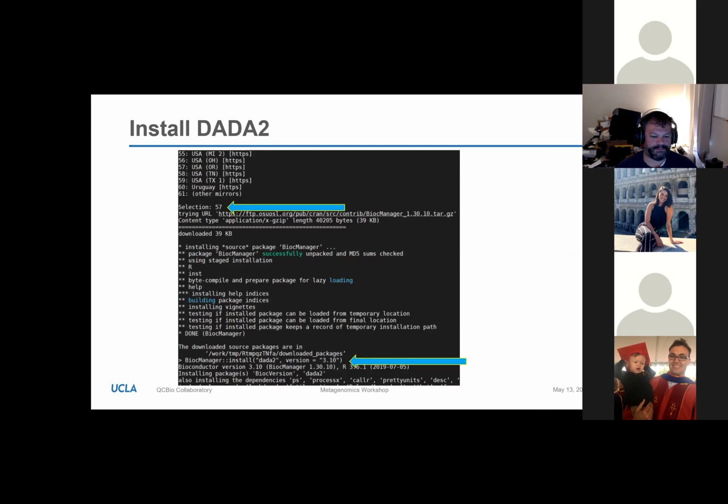Basically, this entire pipeline I made here, including navigating all the dependency issues, was done yesterday in response to your feedback, because I got the impression that people are not familiar with this approach and wanted an introduction to DADA2. Because of that, I was making these last night, and that last set of slides will be incorporated into the slideshow that gets shared.